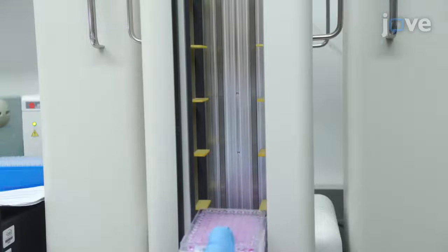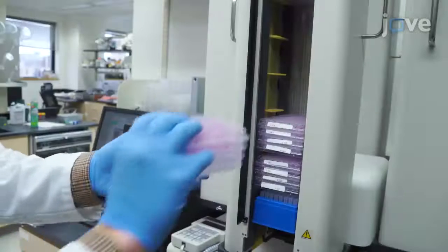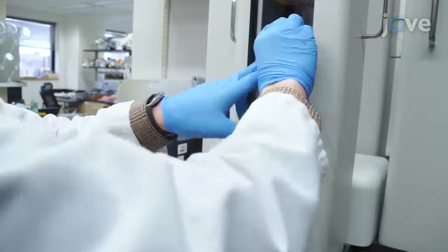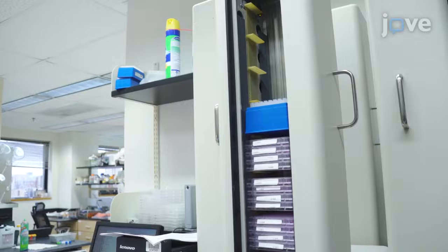Then, load 4 96-well V bottom plates in rooms 2 through 5, with 2 upper plates containing stock concentrations from the ordered library and the other 2 lower plates empty. Additionally, load one box of AP96P20 pipette tips in room 6.